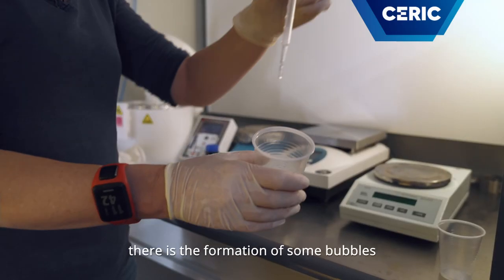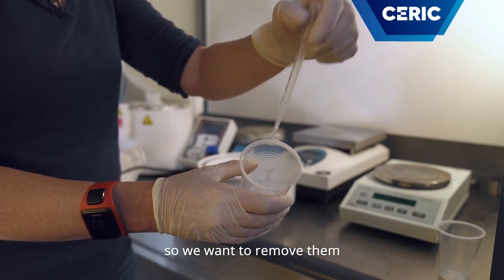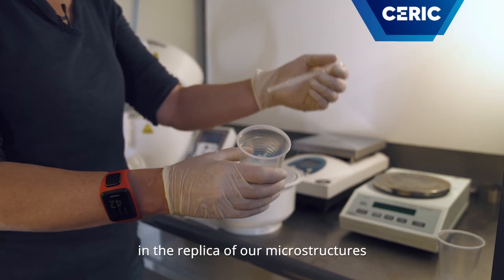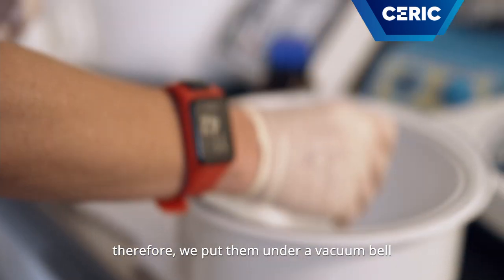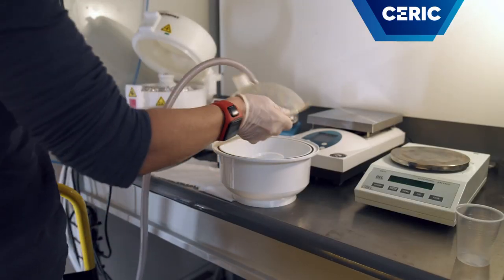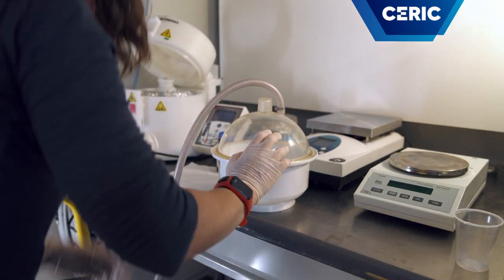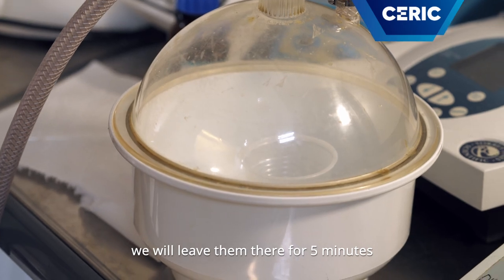After mixing, there is the formation of some bubbles in the container, so we want to remove them, because we don't want to have defects in the replica of our microstructures. Therefore, we put them under a vacuum bell. We will leave them for 5 minutes.